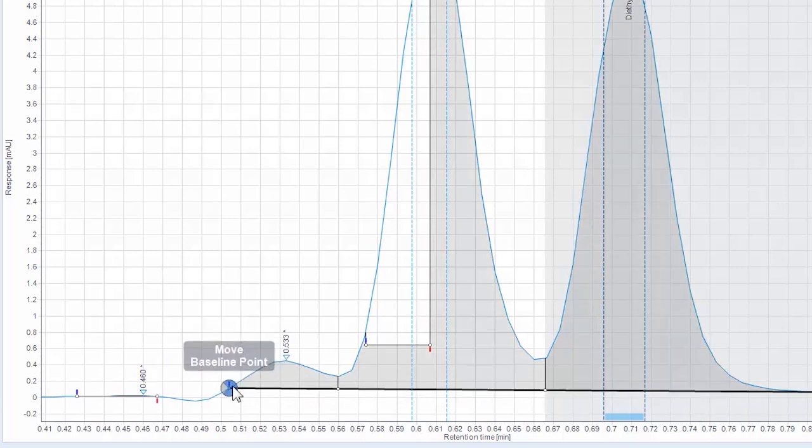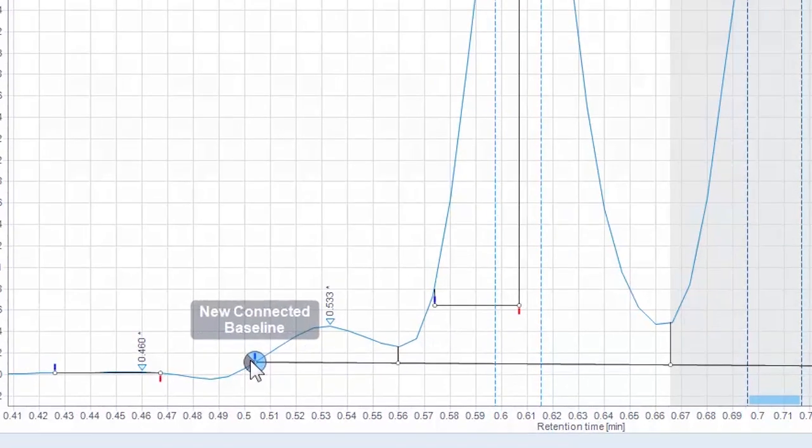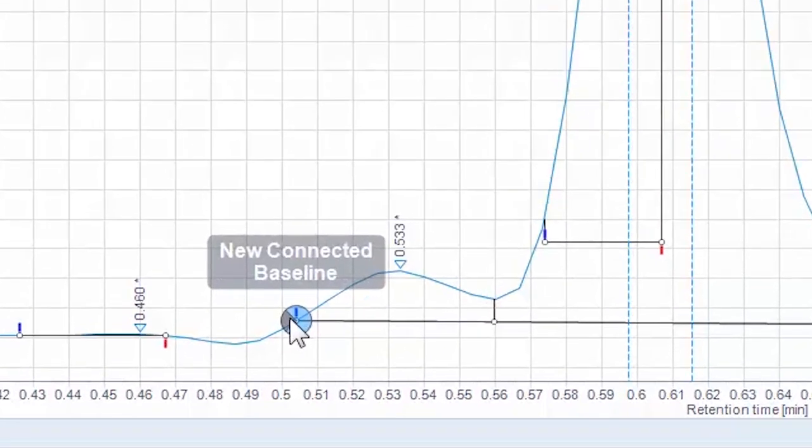Or create a new connected baseline from an existing point by clicking the appropriate part of the point selector.